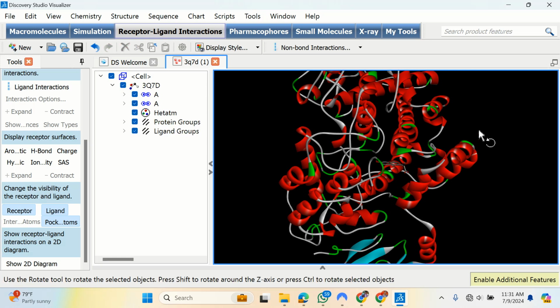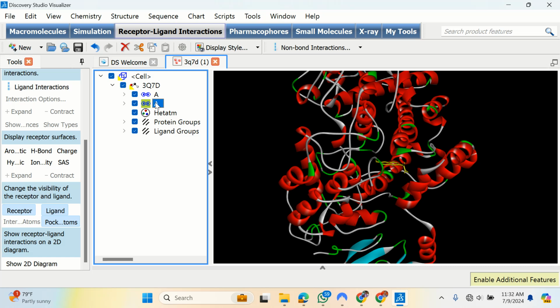This is the ligand protein complex, right? I want to save my protein as a clean protein, and then save my ligand as a compound before the docking. To do that, I will first save the protein, which means I will delete the ligand and then save just the protein. There's an arrow here as usual. I'll hit this arrow, highlight the ligand, and click delete from my keyboard.